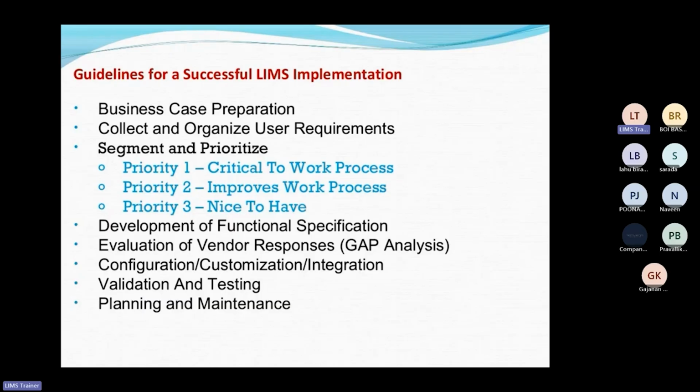Finally it goes into the production environment. When we are working in the production environment, if new cases evolve or you want to add a new test, all those things I will explain in our further lectures. Do you have any questions about LIMS implementation?